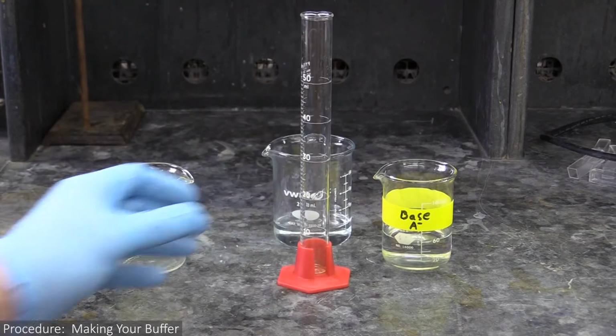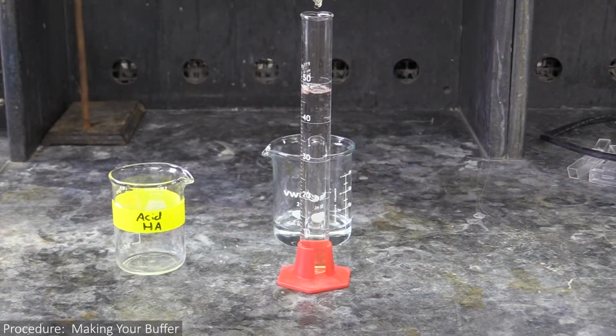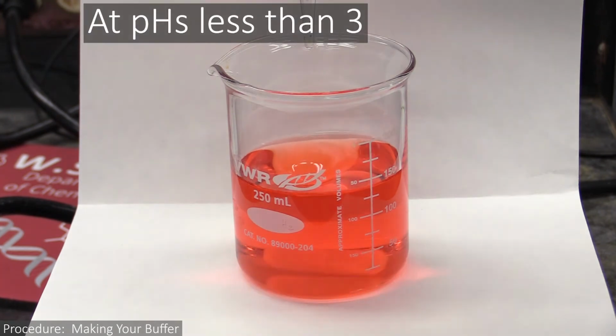You can use a graduated cylinder to measure out the acid and base solutions you use. Once you have your buffers made, add a few drops of universal indicator to them. This is a dye that will change color depending on what pH your solution is.